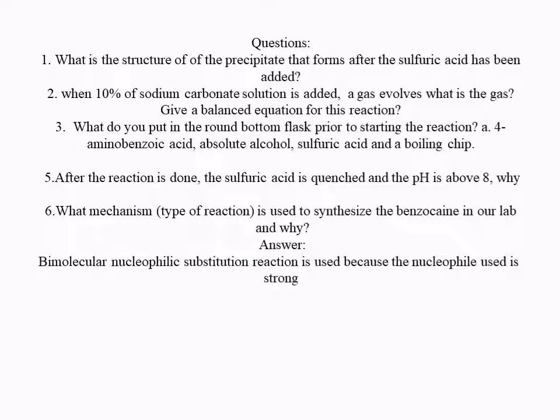Number 3: What do you put in the round bottom flask prior to starting the reaction? We have to put the starting materials with boiling chips to avoid overheating.